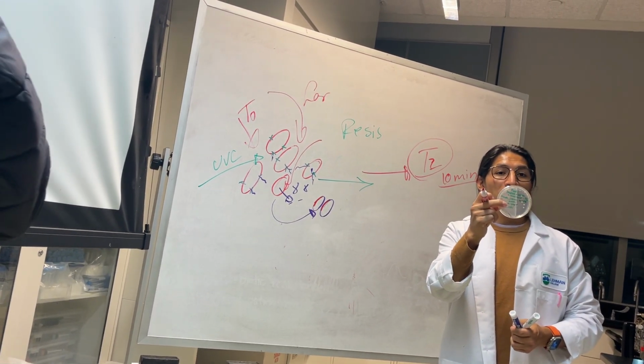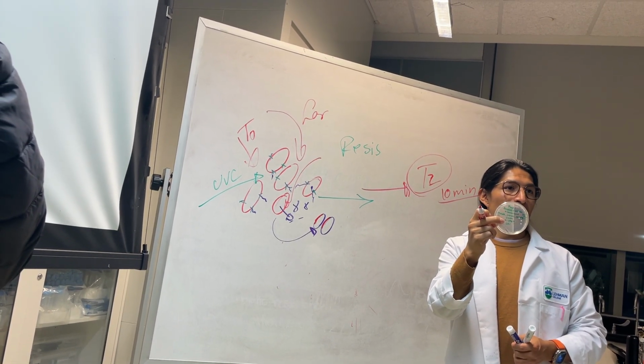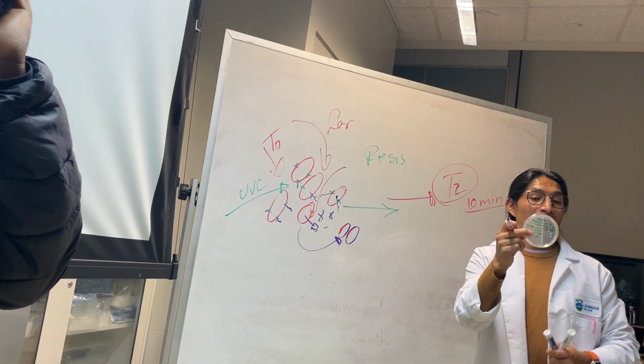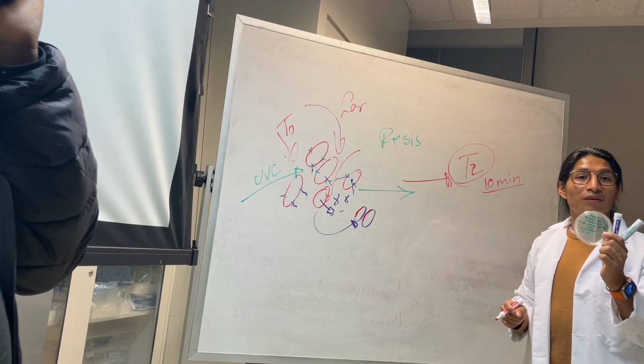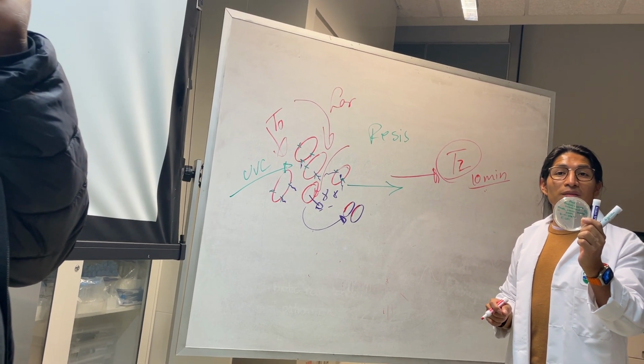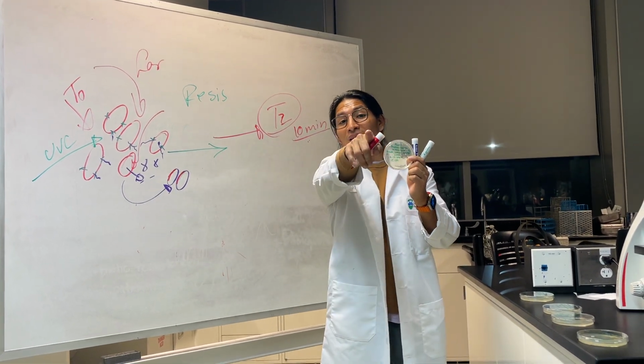The same as plate 4? No. Oh, if it's half with the same conditions? Same conditions. The only thing I change is time. A lot more growth. What will be the outcome? Probably more. A lot more dead cells.